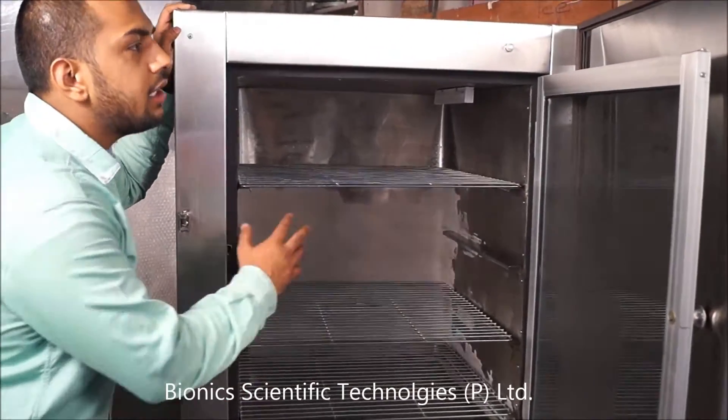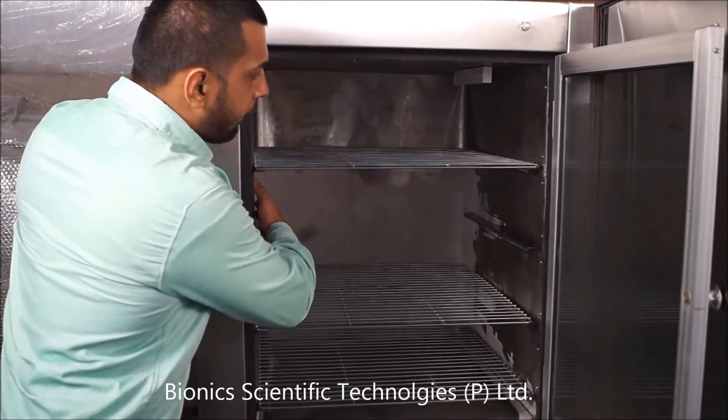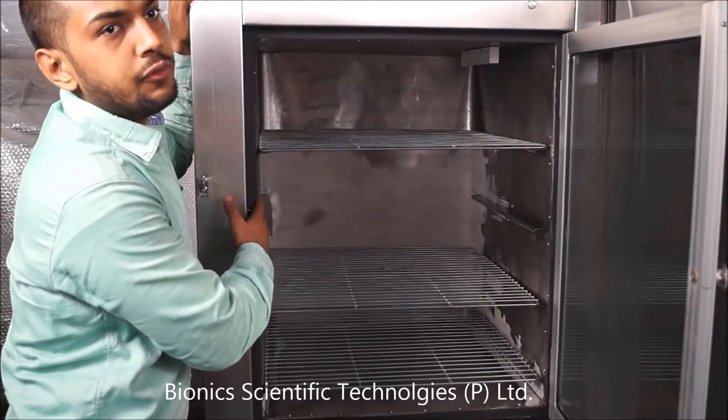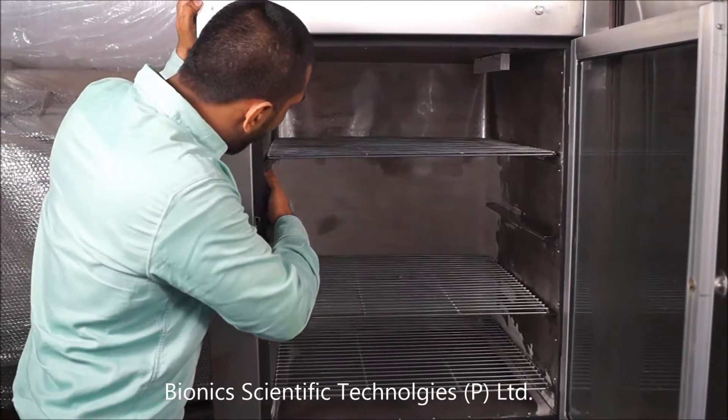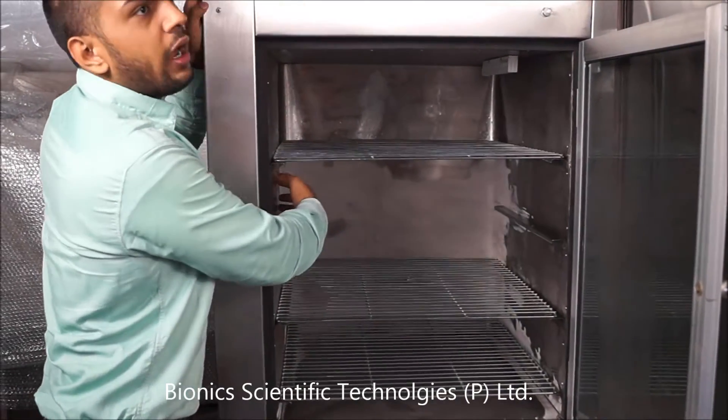The inner chamber of this deep freezer is completely made up of stainless steel, and it is also very easy to wipe and clean.